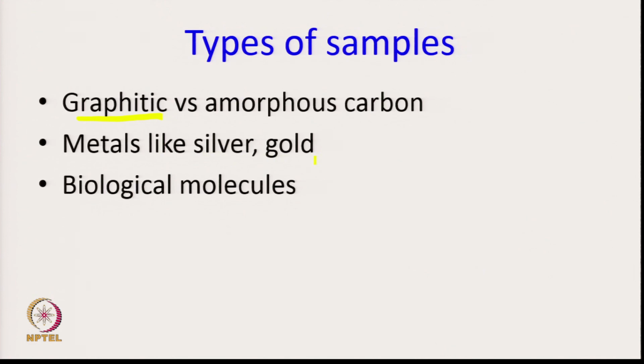They give very strong signals. If there is a silver nanowire or a silver particle added inside a polymer and it is interacting, you can get very strong signals. It is also used for detecting very small amounts of biological molecules which are very Raman active, and a host of chemical compounds which can be detected by Raman.